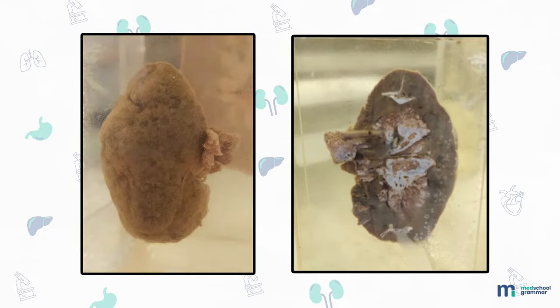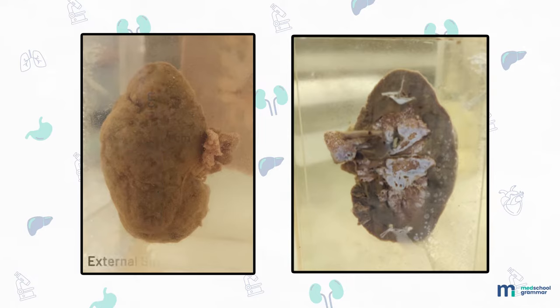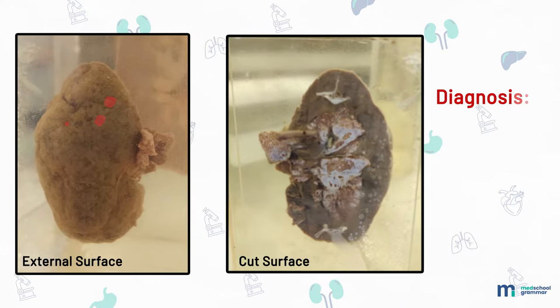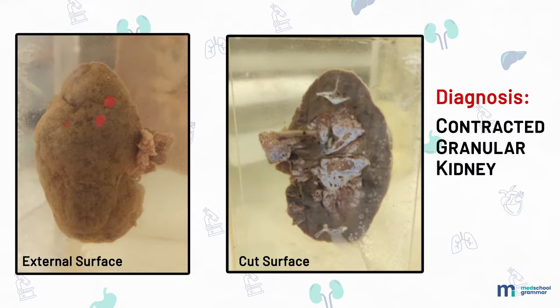Specimen of kidney, 10 by 4 by 1 centimeter. External surface shows coarsely granular appearance, presence of few tiny cysts and scars. Cut surface: cortex is narrowed, medulla shows congestion, and there is increase in perinephric fat. Diagnosis: contracted granular kidney.